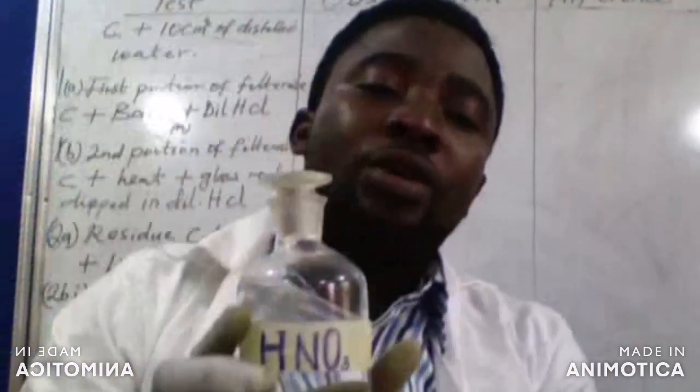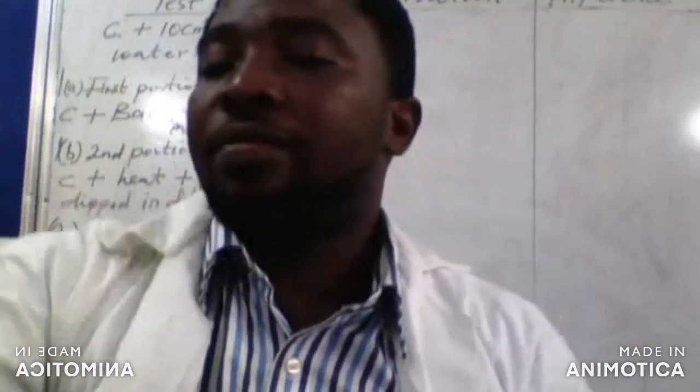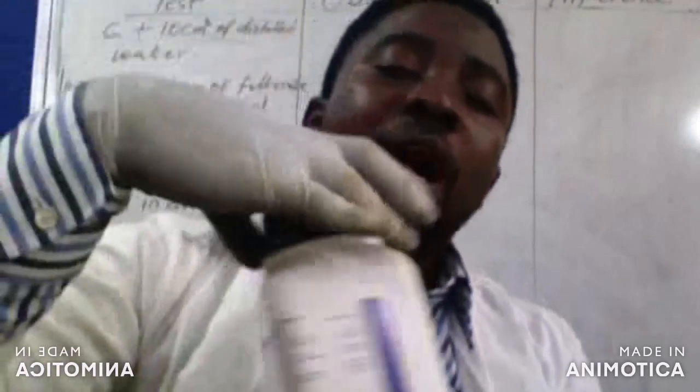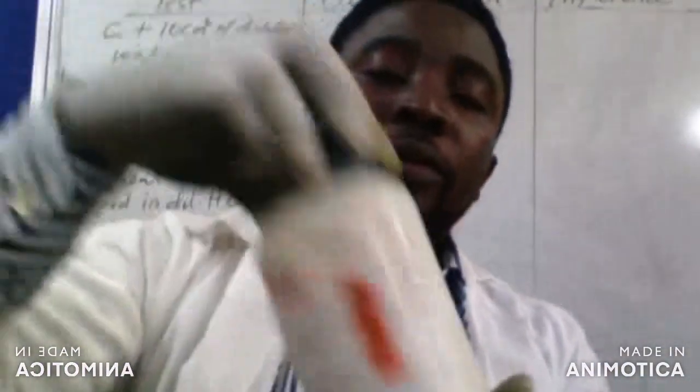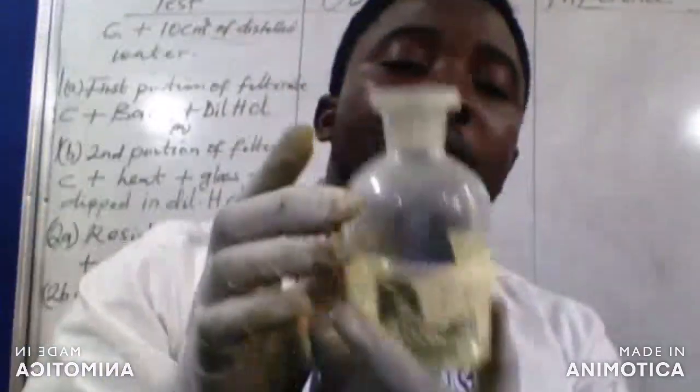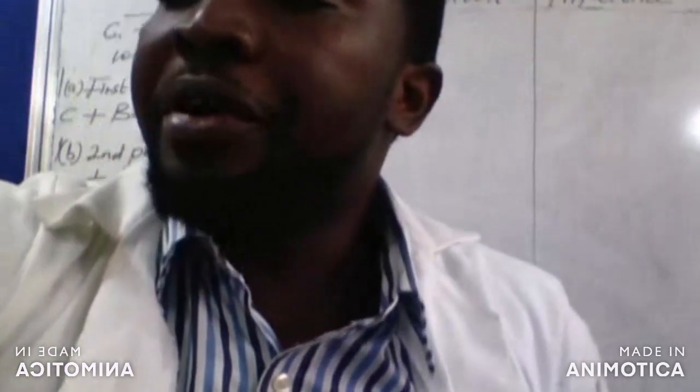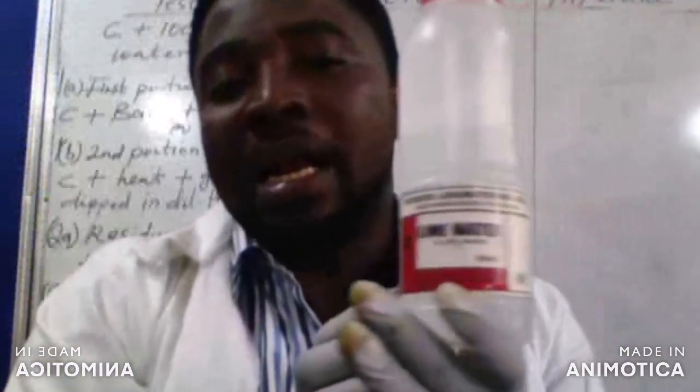This is my dilute trioxide nitrate(V) acid. I also have a sample of ammonium carbonate, and a sample of anhydrous copper sulfate. Here is my barium chloride solution, and this is my lime water.